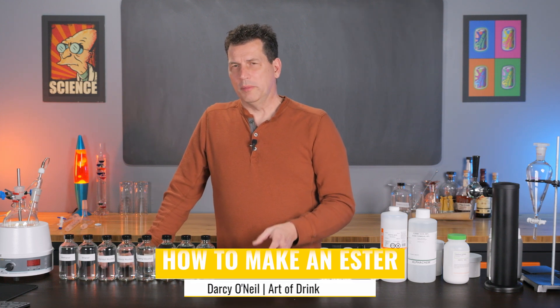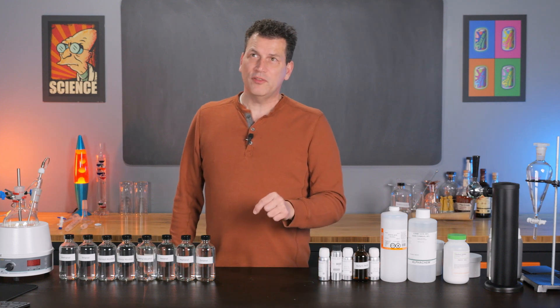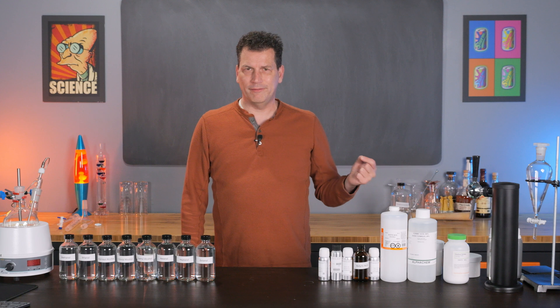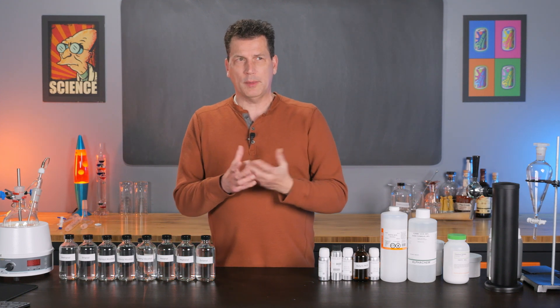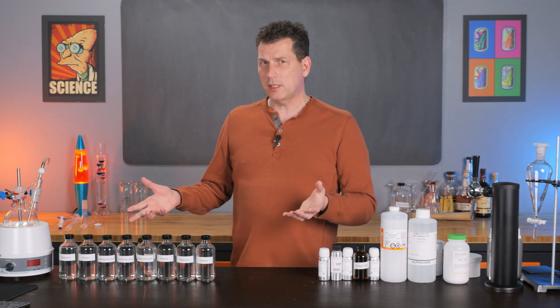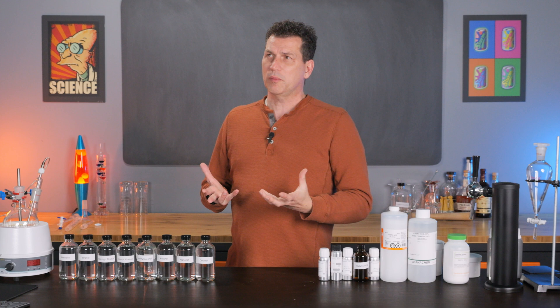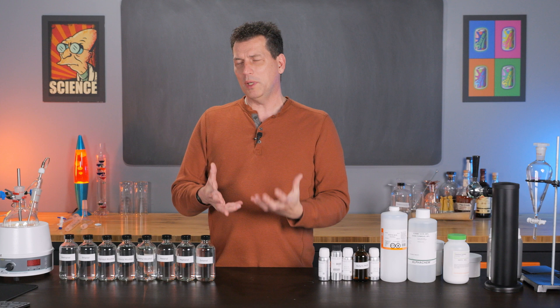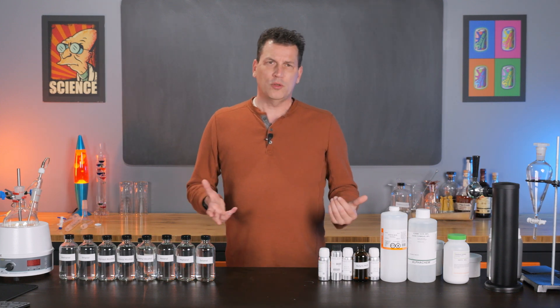Today I'm going to show you how to make an ester, because they're really easy to make. More importantly, I'm working on what I believe to be a Dr. Pepper recipe that I found in a book from the 1950s, and it calls for a specific ester that I'm having a hard time sourcing. So I just decided to make it, and I thought I'd take you along for the ride because esters are probably one of the most abundant flavor compounds we use.